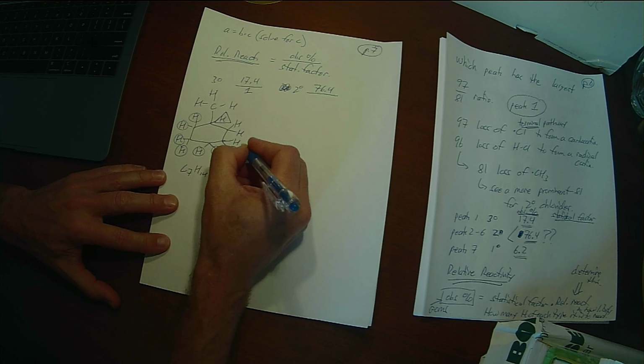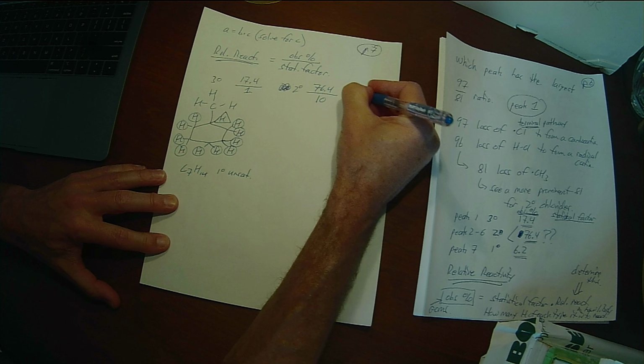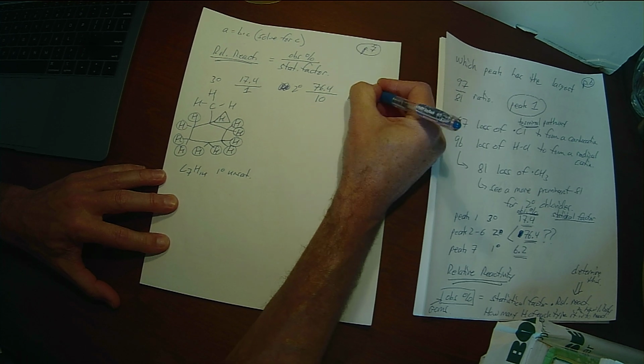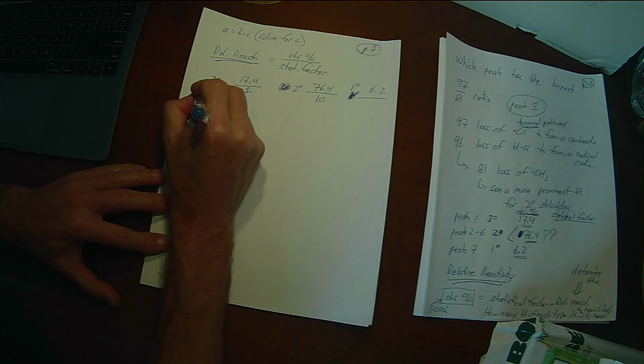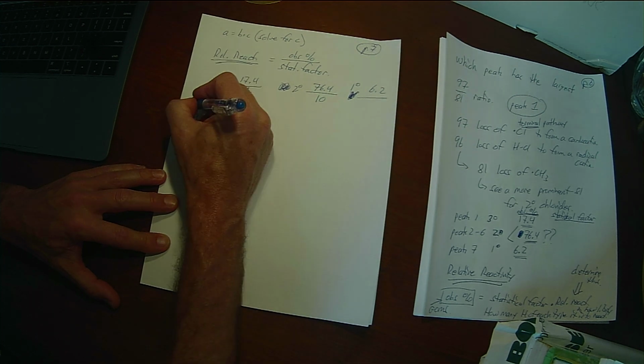There's 5 CH2 groups, so 10 total. And for the primary, we're going to take that 6.2. And how many primary hydrogens are there? 3. Must be what's left, right? It's got to add up to 14.